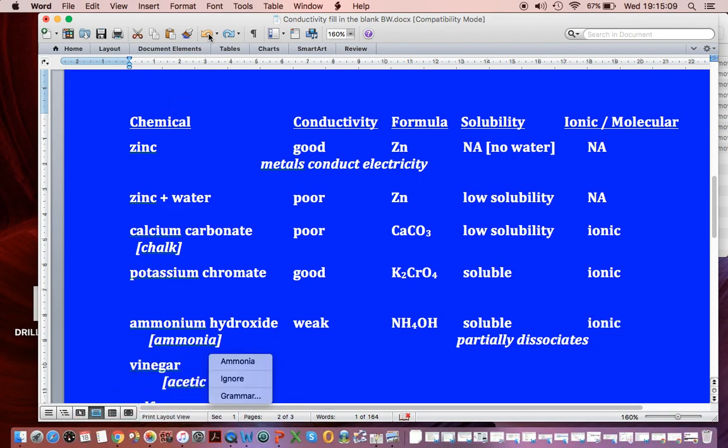Now we go to vinegar, or Weingar, if you're hooked on phonics. Get out of there. And it was weak. It behaved very much like the ammonia, or ammonium hydroxide.